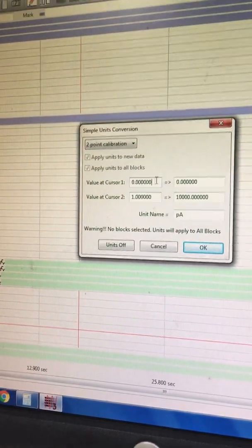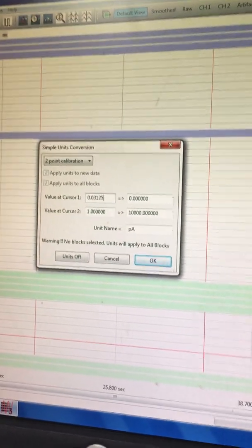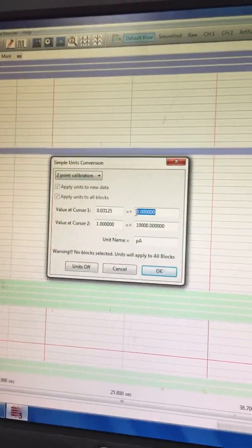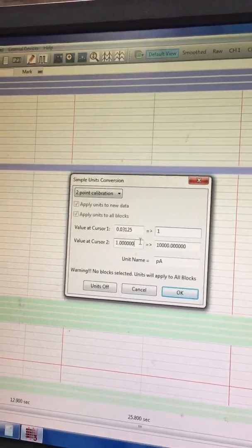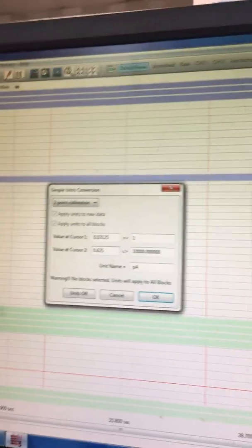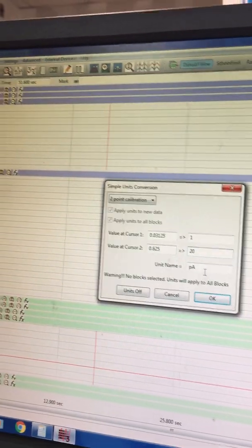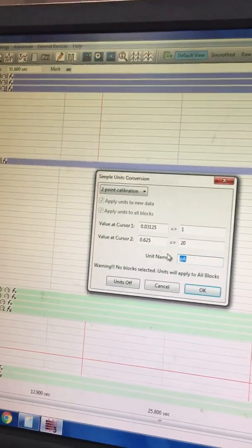Right now under cursor 1, I'm going to be entering 0.03125, and this is going to be 1. And under cursor 2, I'm going to be entering 0.625. That would be 20 degrees Celsius. And I'm going to be saying OK.